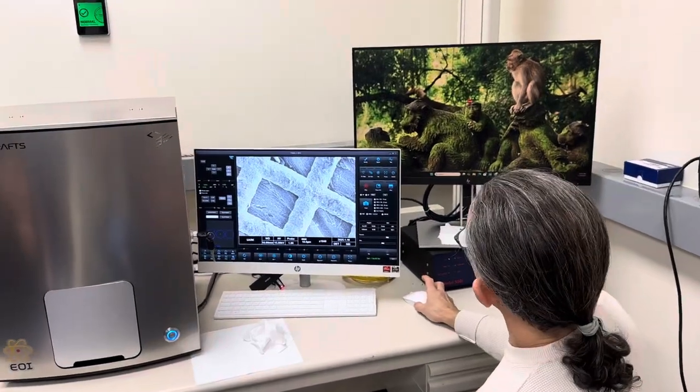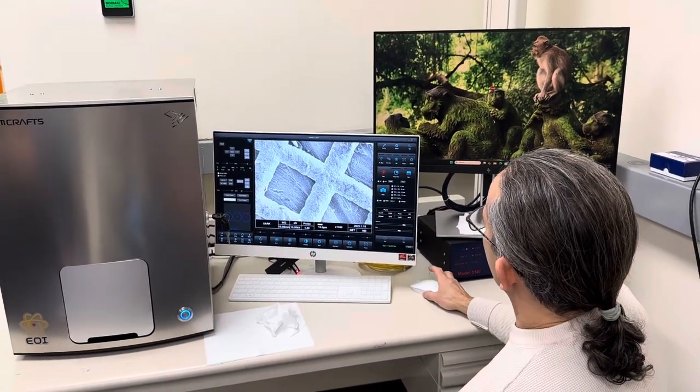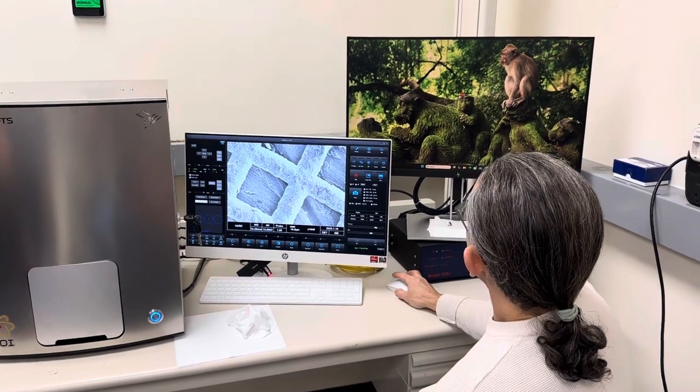To the right, goes to our next screen, right? It's not above, so it can't go up. Side to the right.